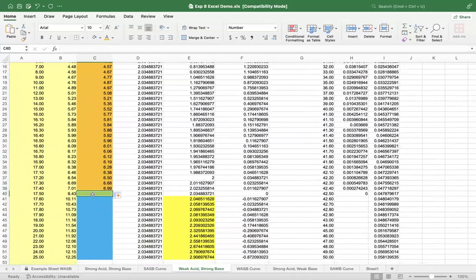Okay, so what about this point right here? This is the neutral spot. For mine, it's an exact neutral point. So there's only conjugate base present. And since there's only conjugate base present, the only thing I can do is use the Kb to find out what the hydroxide concentration is, right? Because since the conjugate base is present and it's a little basic, it raises my pH because there's a little bit of hydroxide being generated.